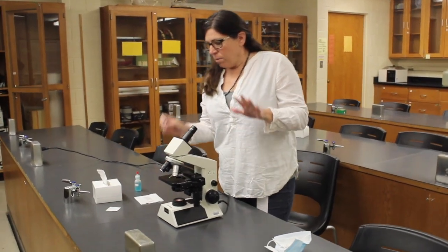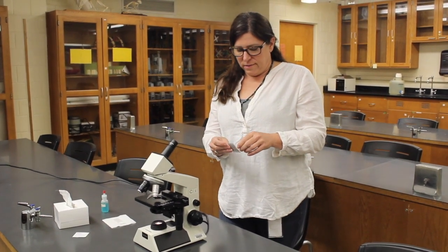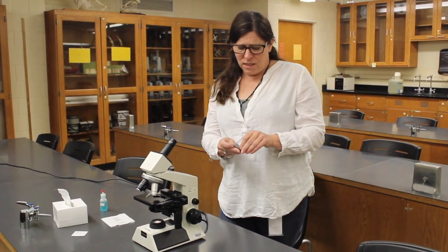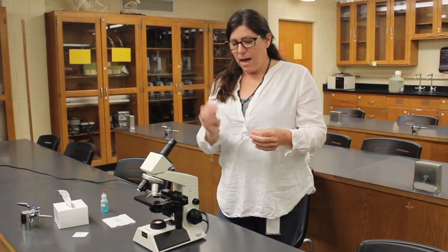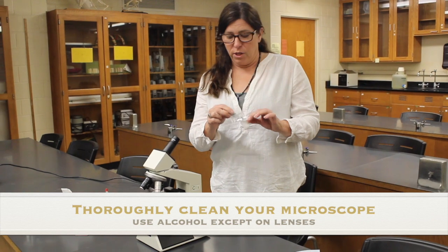When you have your microscope with you, the first thing you're going to do is clean it. Again, we're being very careful in time of COVID. So even though it hasn't been used for, you know, a half hour or several days, you're going to clean it. This is an alcohol prep pad, and we're supplying these for you.